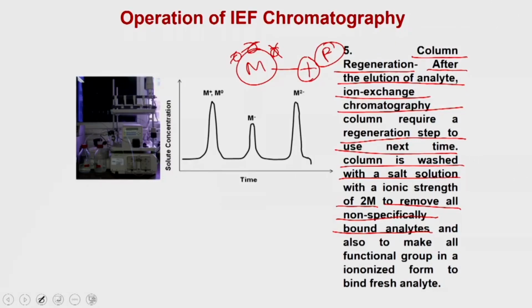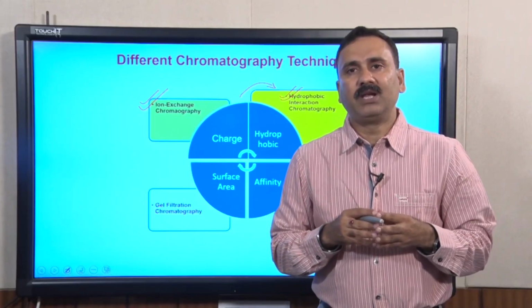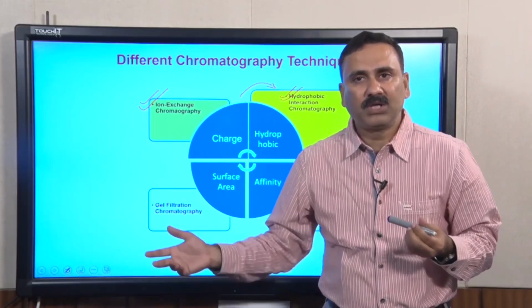That will remove the non-specifically bound analytes, and also make all functional groups ionized to bind fresh analytes. So, with this we would like to conclude our lecture here.